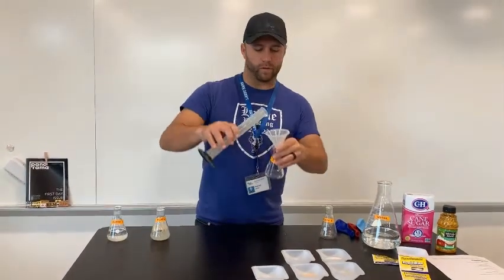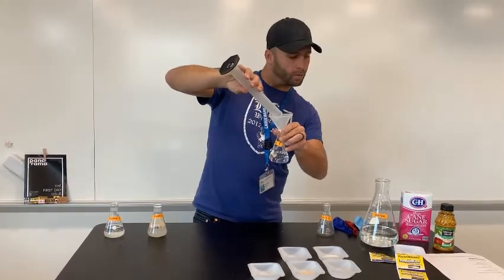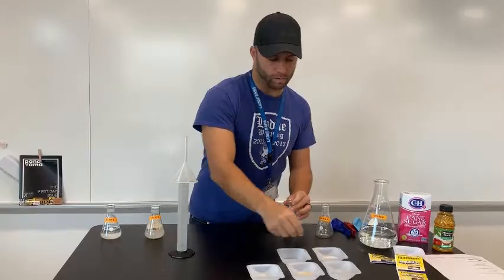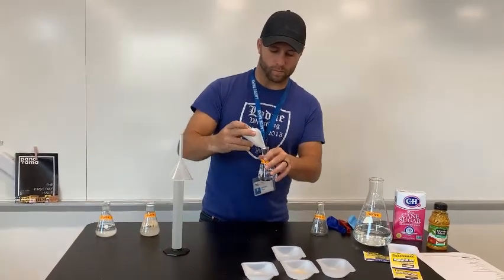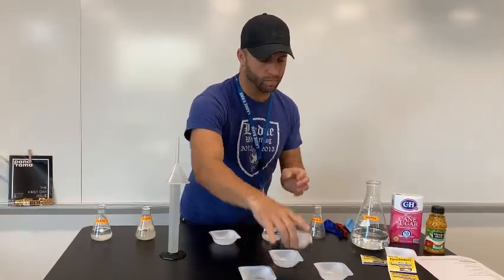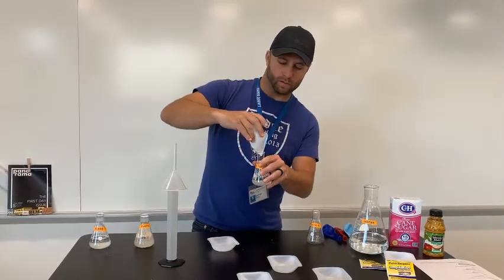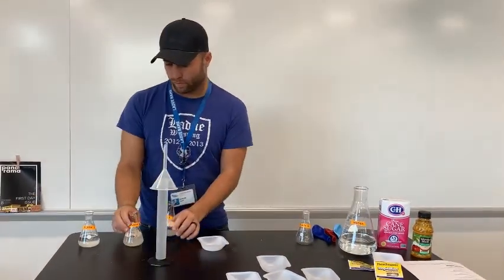For flask three, it'll take 75 milliliters of water — I'll use my funnel once again — then 6.5 grams of sugar, and then one gram of yeast. We'll be topping that off with a gram of yeast. And that is it for flask three — joining the other two flasks over here.